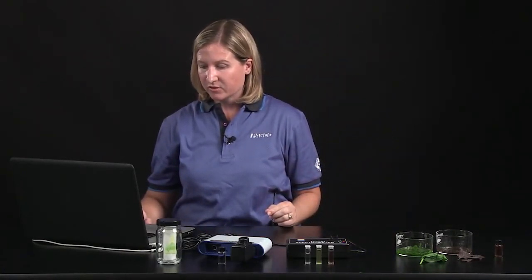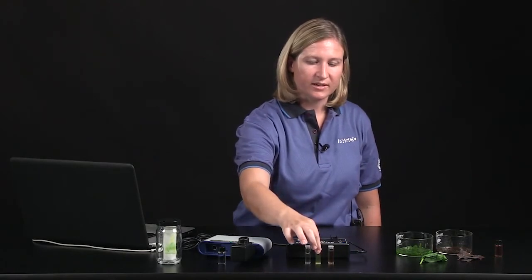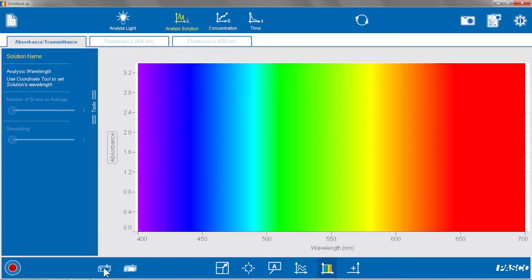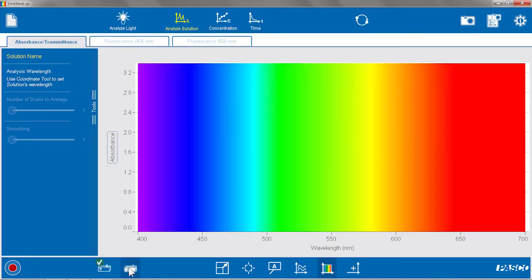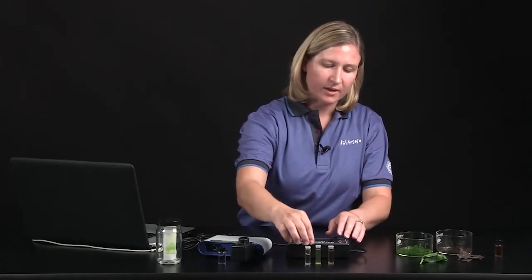I'm going to switch to PASCO's spectrometer app, and there are options listed at the top to do a number of different things. In this case, we're interested in analyzing a solution — we've got our pigments dissolved in ethanol, and we want to see the absorbance of all visible light wavelengths. Before I get started, I need to calibrate the spectrometer using the two calibration buttons near the record button. First I calibrate dark: I take my reference solution — again, just ethanol — and press calibrate dark. Then I press calibrate light. The spectrometer turns its internal lights off during calibrate dark, then turns the lights on during calibrate light. Now that my spectrometer is calibrated, I'm going to take my spinach pigment extract, put it into the spectrometer, and hit record.